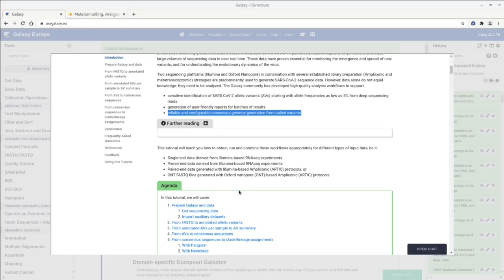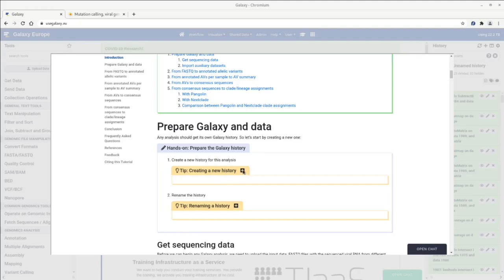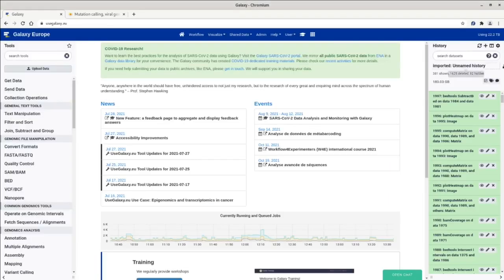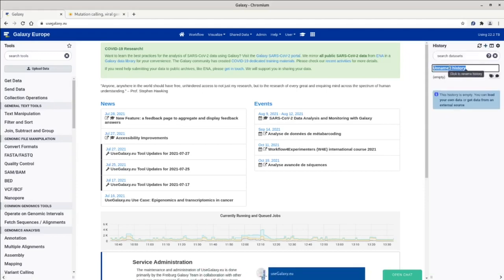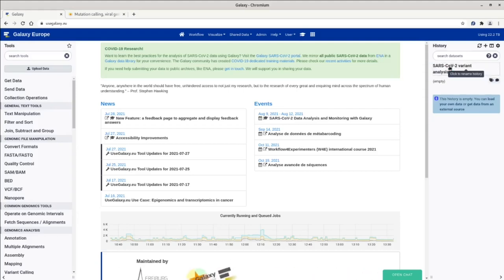We really encourage you to bring your own data and use these exact production-ready workflows that major public Galaxy servers use for large-scale genome surveillance. Before starting any analysis in Galaxy, it's good to create a new history to give the analysis its own workspace. I'll create a new history named 'SARS-CoV-2 variant analysis demo' and press enter to record that name, giving me an empty new history.